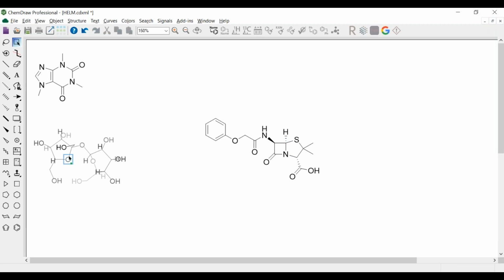Now, if you're talking about, oh, some of these structures, I want to be able to just export them for use into something, yeah, again, you can build out the connectors here using the REST APIs so that you'll have an icon that leads to whatever your molecular modeling software might be. It just really hinges on whether they have the proper REST APIs and how you want those things shuttled over. You'd have to pick formats and things like that.